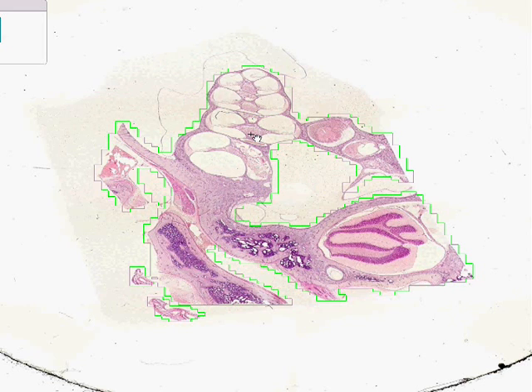The vestibule consists of the saccule and utricle and therefore the macula, which is the organ of static equilibrium, we will identify here. The semicircular canals will be in various places. This may very well be part of one, but we'll look in another slide at the portion where the semicircular canal is dilated, called the ampulla, in which the crista will be identified.